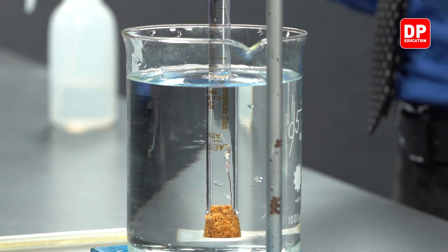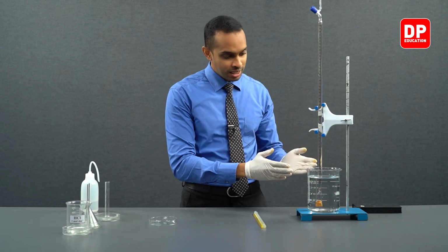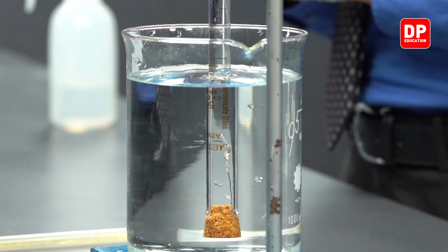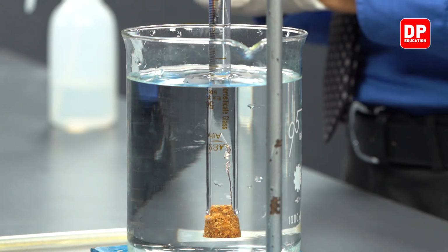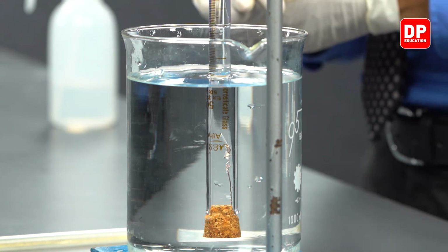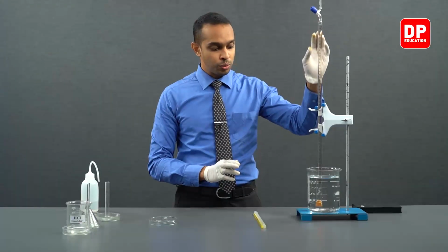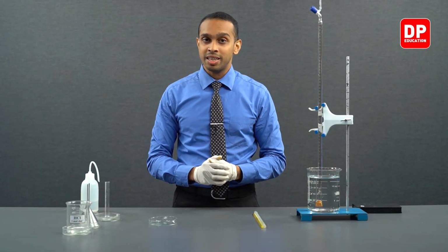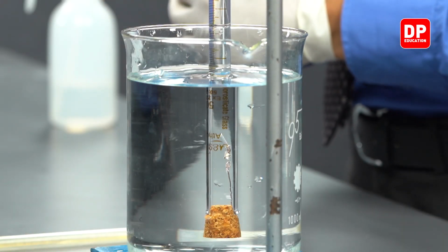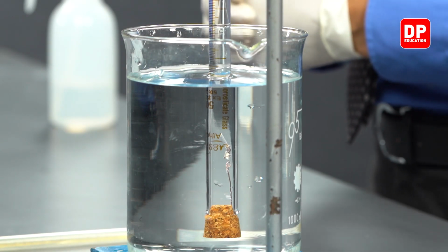We saw that when the reaction starts, there will be formation of gas bubbles. You can see the reaction has not yet started because we saw in the very first trial how it looks when the reaction has begun. So we will give it some time for the HCl that was present on this upper part of the burette to go down to our magnesium strip and start a reaction. After the reaction starts, we will allow it to go to completion, and then we will take the measurement.